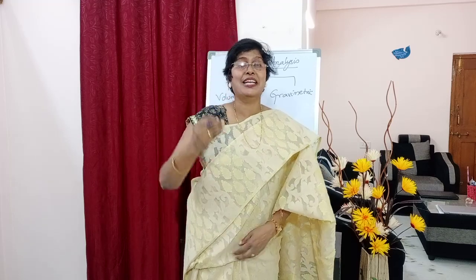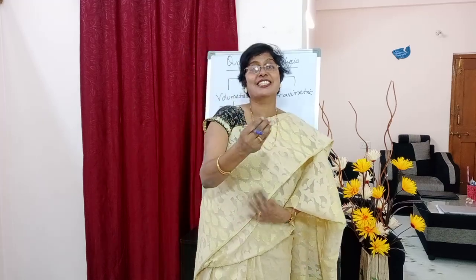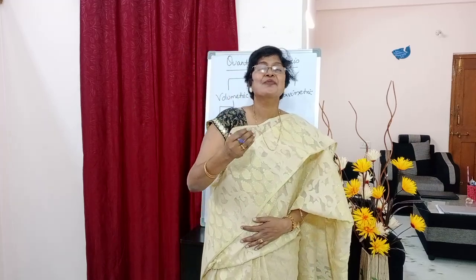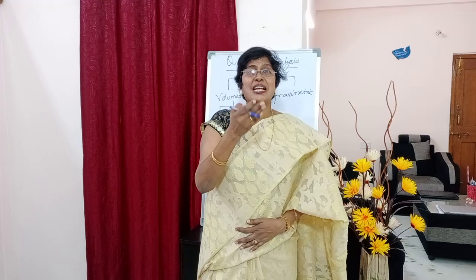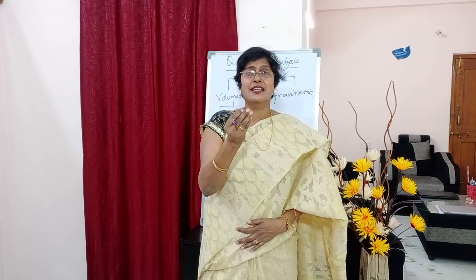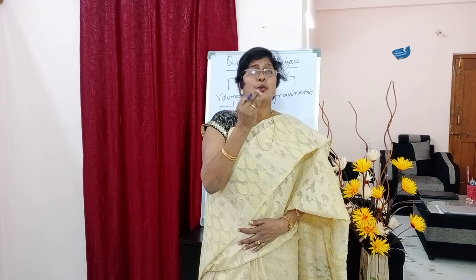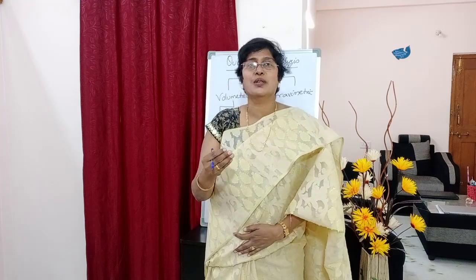Ma'am, this is carbonate. Ma'am, this is that. Ma'am, I have observed this color. Ma'am, I got this precipitate. So like that, you have identified various anions. So the presence of anions and cations you have identified. So that is called qualitative analysis. Okay. So we have determined or identified the constituents present in the salt mixture.